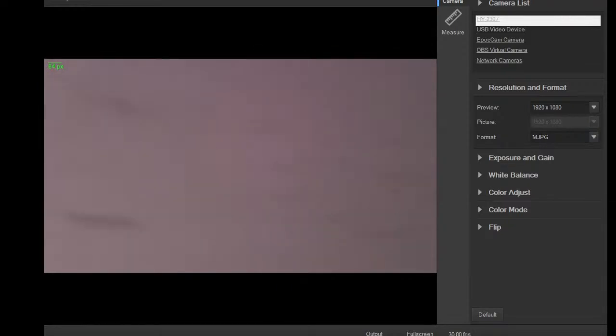So yeah, even a lowly gutter or a small puddle after rain is most likely going to have something in it. Life is everywhere. There you can see the terminator. There's the edge of the cover slip. There's the edge of the water terminator as the cell is shrinking. The water volume is shrinking from evaporation. And pretty soon it'll just get smaller and smaller, and you'll see this wave of water just smash everything together. And there you can see that little thing riding down it like a flume. Things touching the water edge are actually sliding down.